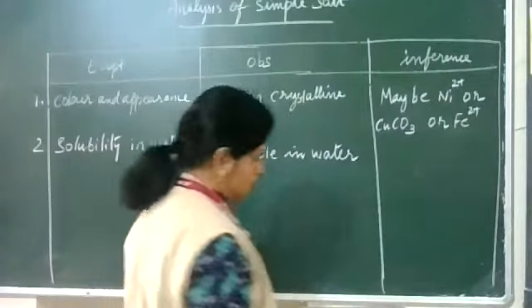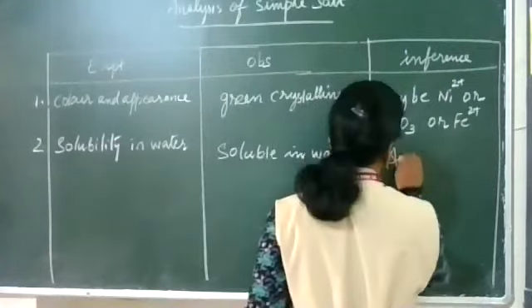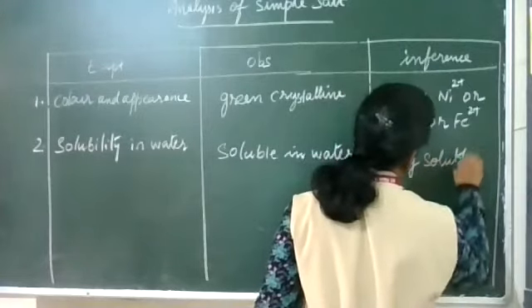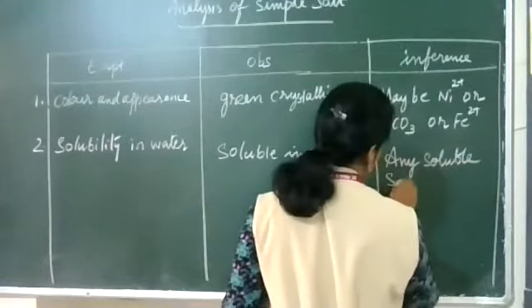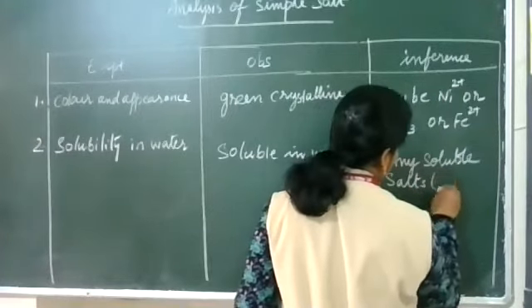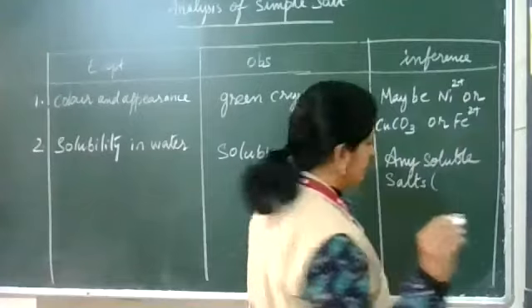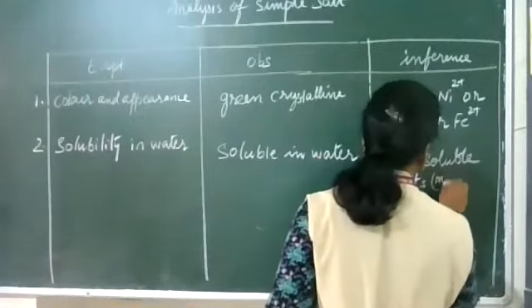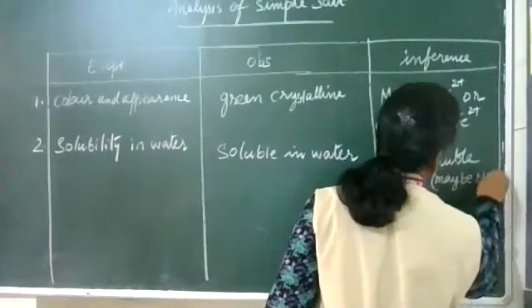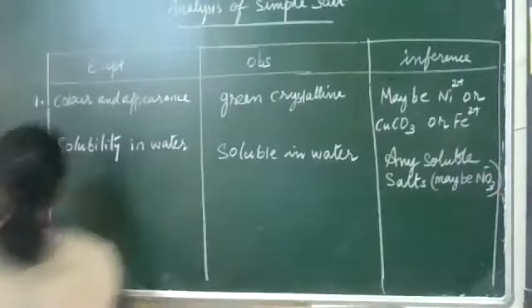Any soluble salt here may be nitrates. Nitrates are very much soluble in water.